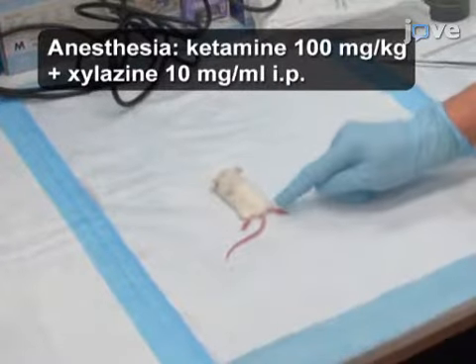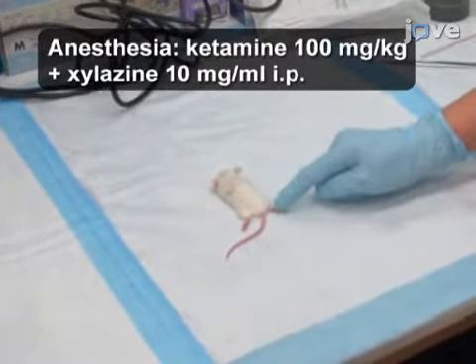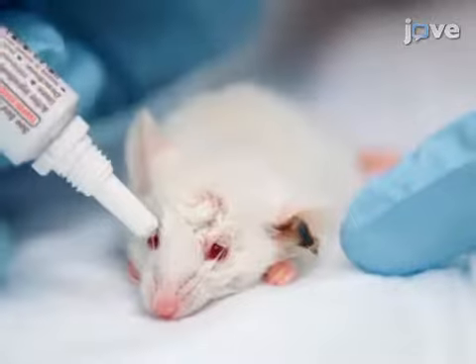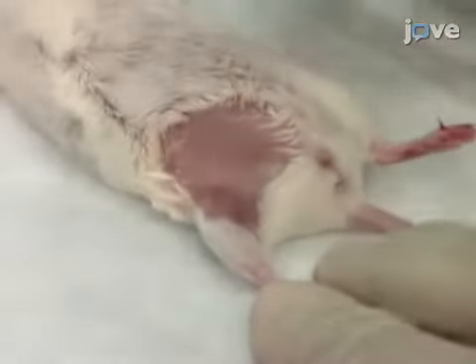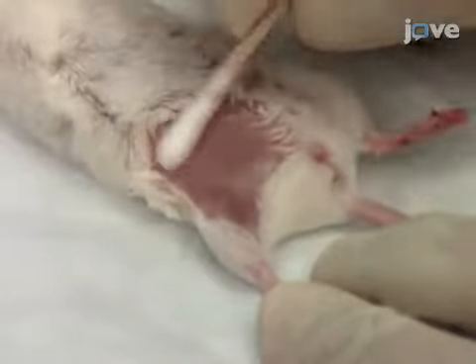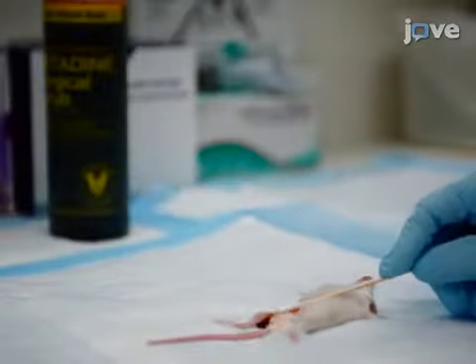Begin by confirming the appropriate level of sedation by toe pinch of a five to six week old, 20 gram mouse. After applying eye ointment, wipe the shaved right groin area several times with sequential sterile 70 percent isopropyl ethanol soaked cotton swabs, followed by a betadine surgical scrub.